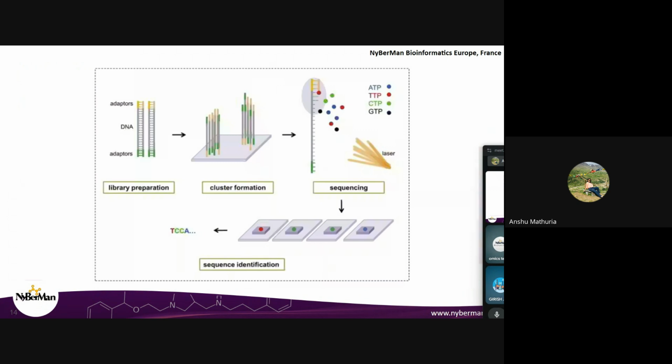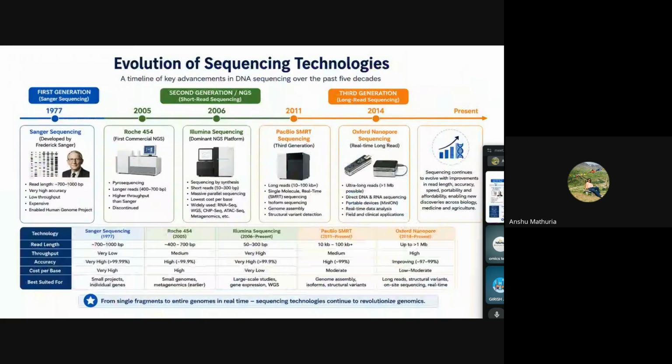Now I mentioned that there was NGS sequencing happening, right? So we have our sample, that is our DNA or RNA. We feed it into the NGS machine. So NGS Illumina that I mentioned, Illumina here is shown as a machine. This machine sequences the data. So we put our genome, our DNA or RNA, into the machine. After we put it in, the machine will sequence it and give us the results in the form of files, that is the FASTQ files. About the files we will learn again in the coming session.